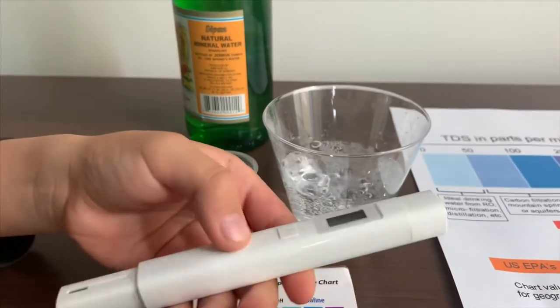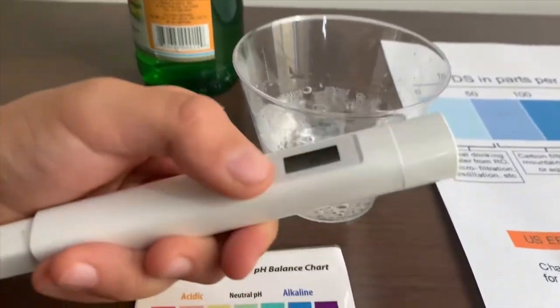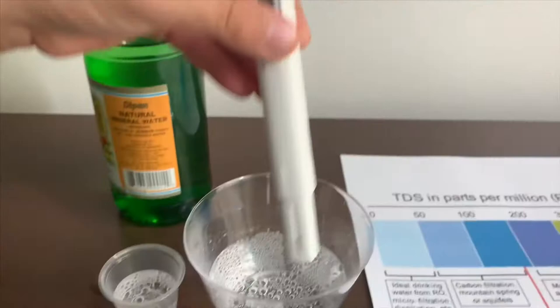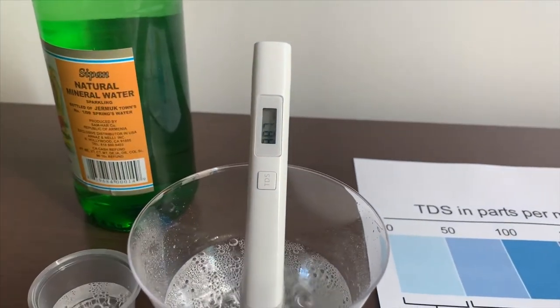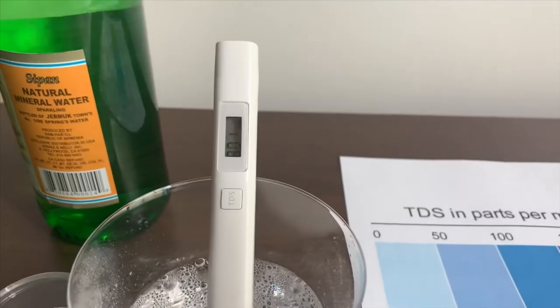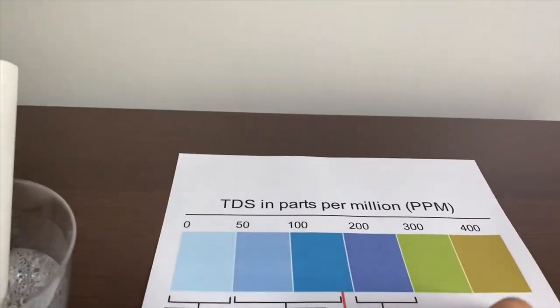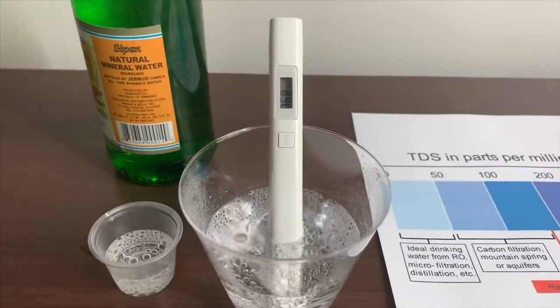If you want to buy this TDS tester, check the link down below. Turn on the TDS tester, make sure it says zero, and put it in. The reading is 800 — it's off the chart. It has high mineral contents.